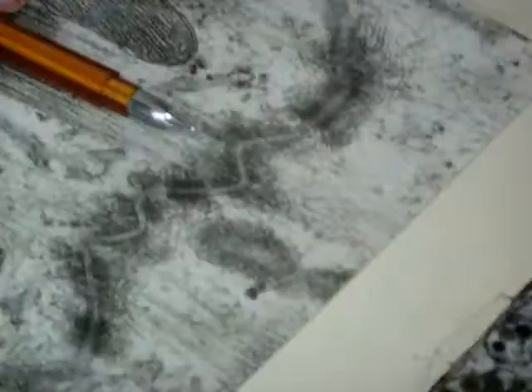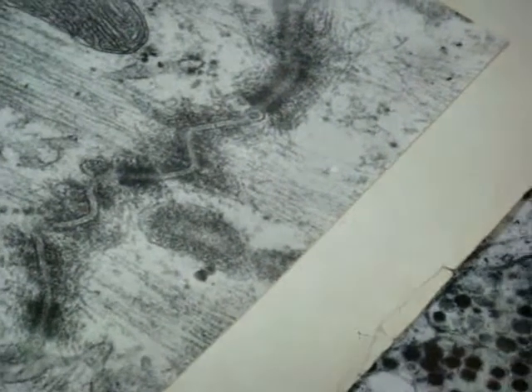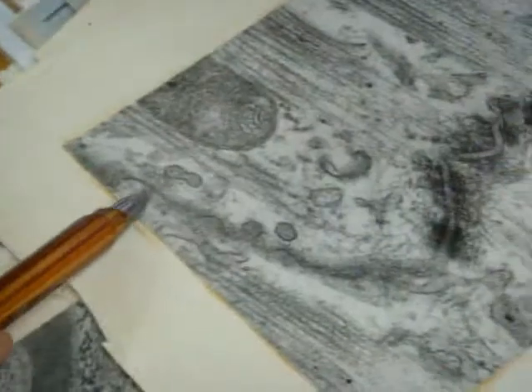Okay, this is a cell, because we can see myofibrils and a junction. So this is cardiac muscle tissue, with mitochondria. Look please at the transverse portion of the intercalated disc, which consists of desmosomes, and this lateral portion where two membranes are close to each other, a nexus.